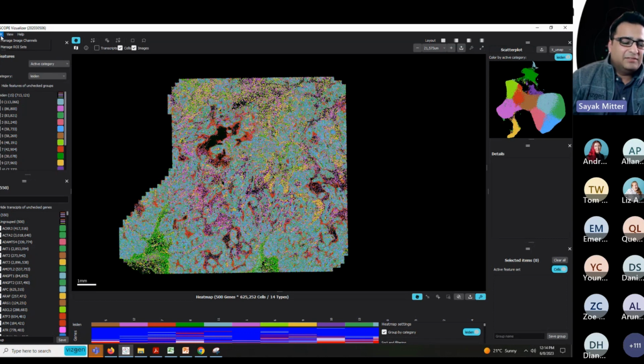With the Edit menu, you can definitely look at and manage the imaging channels, which are the different staining channels. And the View menu lists the different little windows, which we'll talk about in a second, such as the scatter plot, spatial features, etc. When they're checked, it means that they are open at the moment. And furthermore, we have the Help menu where you can find out about Vizgen, or you can open the visualizer log folders through the report folder. Right, that is enough about that little menu bar over there.